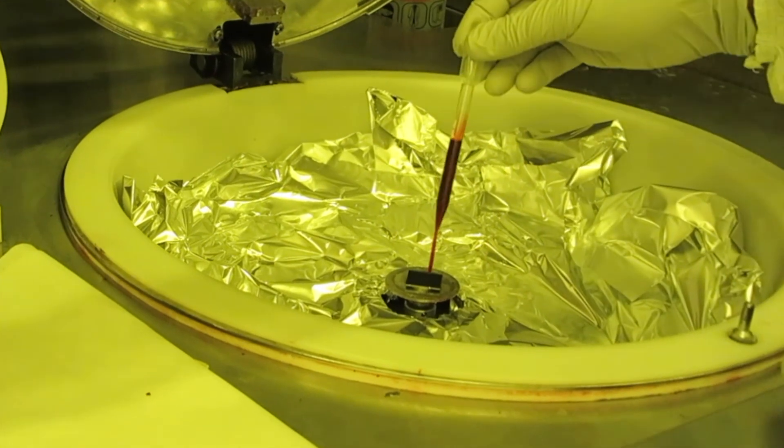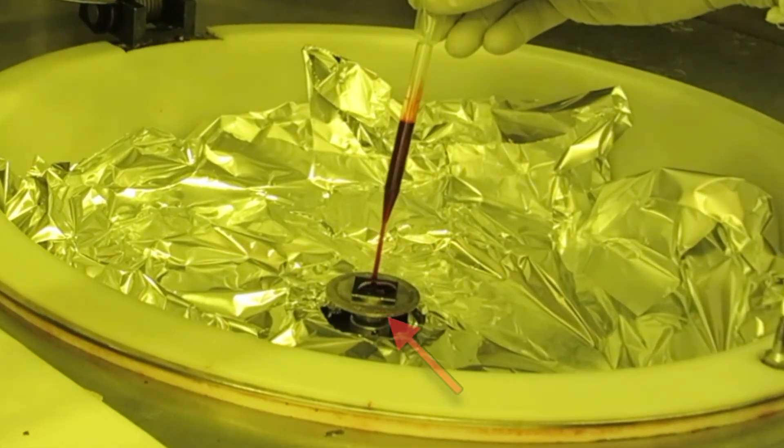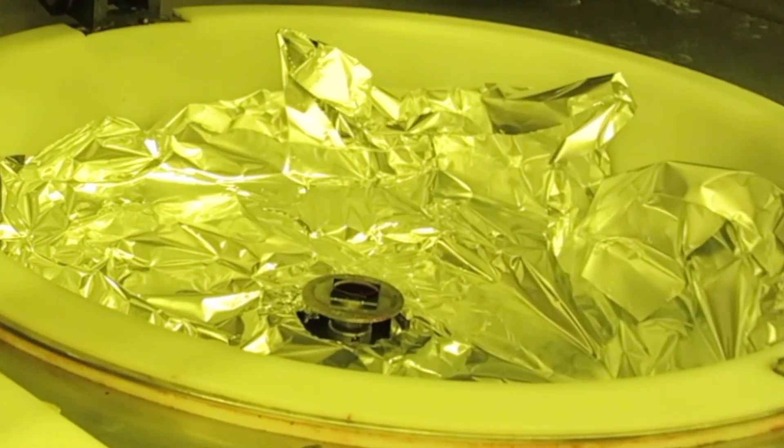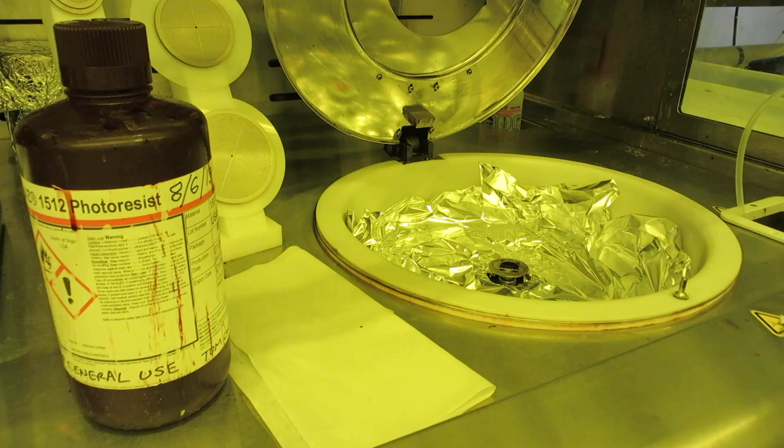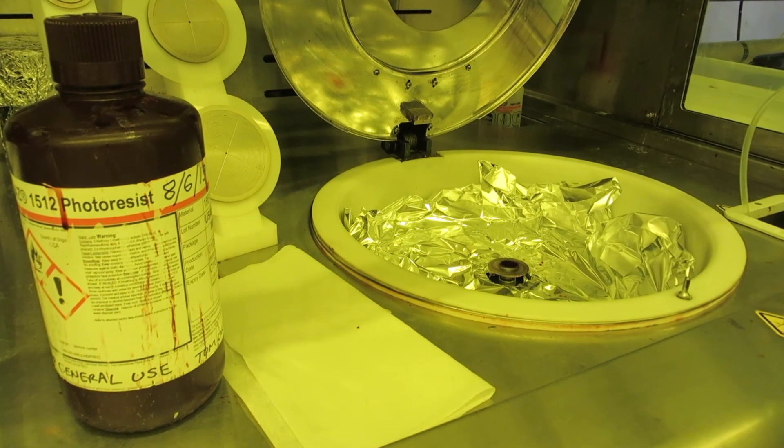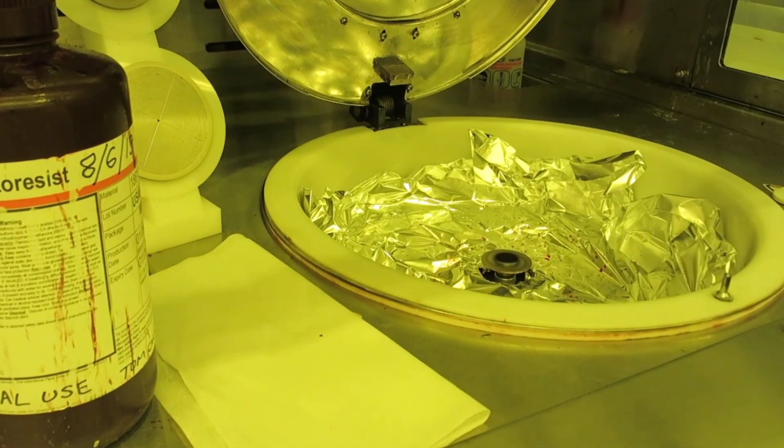Try to cover about two-thirds to three-quarters of the face of the chip. The spinner tilts slightly towards the rear, so start towards the front of the sample when you're dispensing it. Hit the green start button to start the process. You don't want to waste time after dispensing the resist before you start spinning, otherwise you may get a skin on the surface which will cause streaks in your resist.